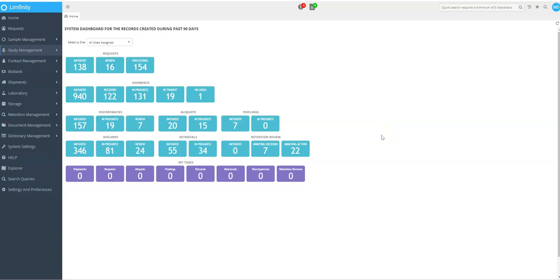Welcome to Limfinity Biobanking LIMS. In this video, we're going to talk about how to access audit logs.